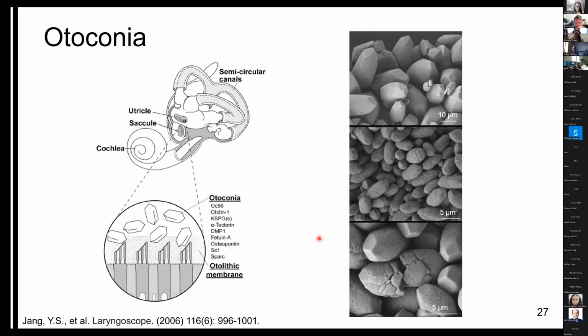Currently there are several studies of otoconia degradation that exist with SEM. Here's one example. However, SEM only visualizes surface morphology. Information about early and intermediate otoconia degeneration manifesting inside the biocrystal is limited. Therefore, we want to use PSHG microscopy to characterize the degradation of otoconia from within.